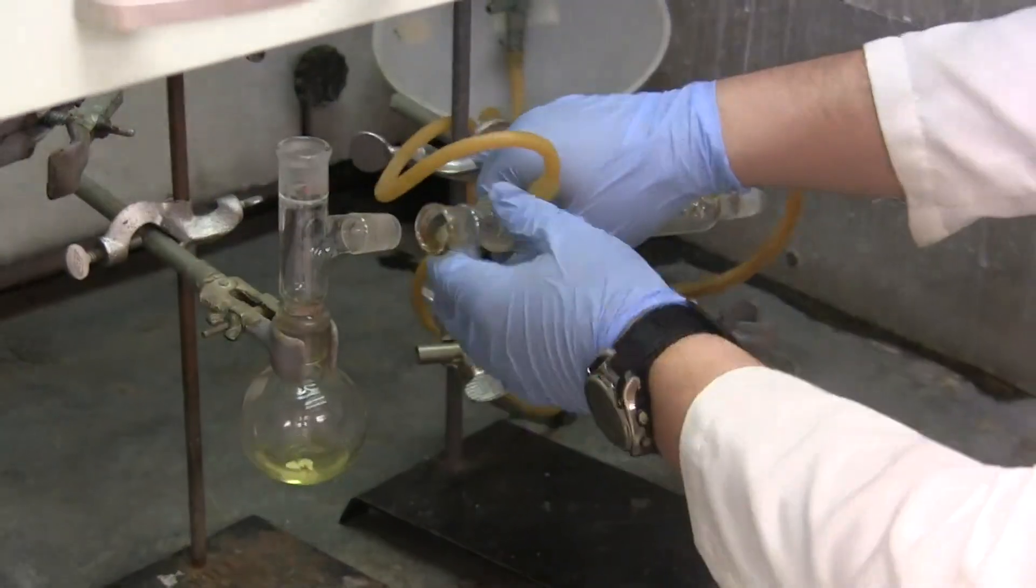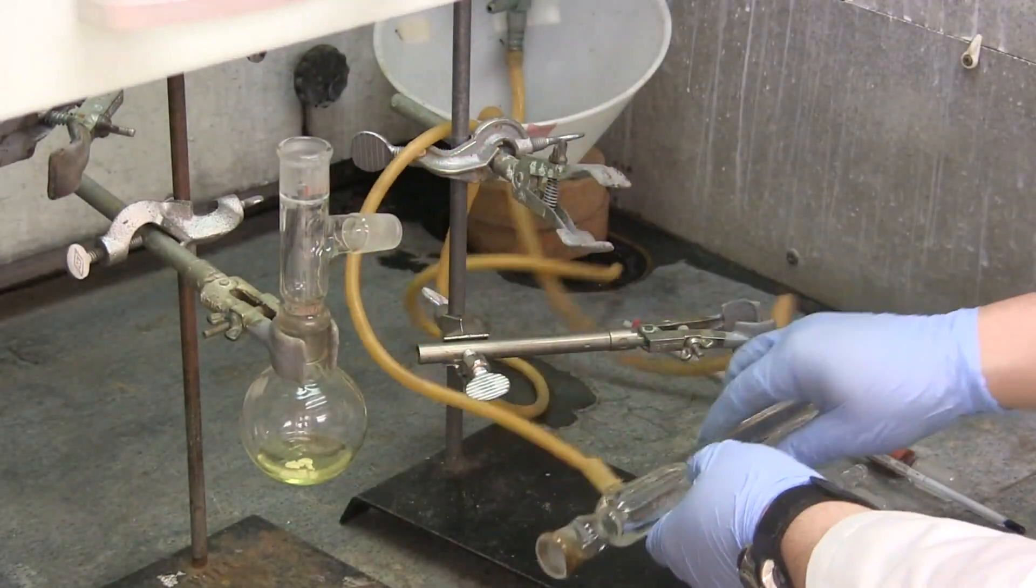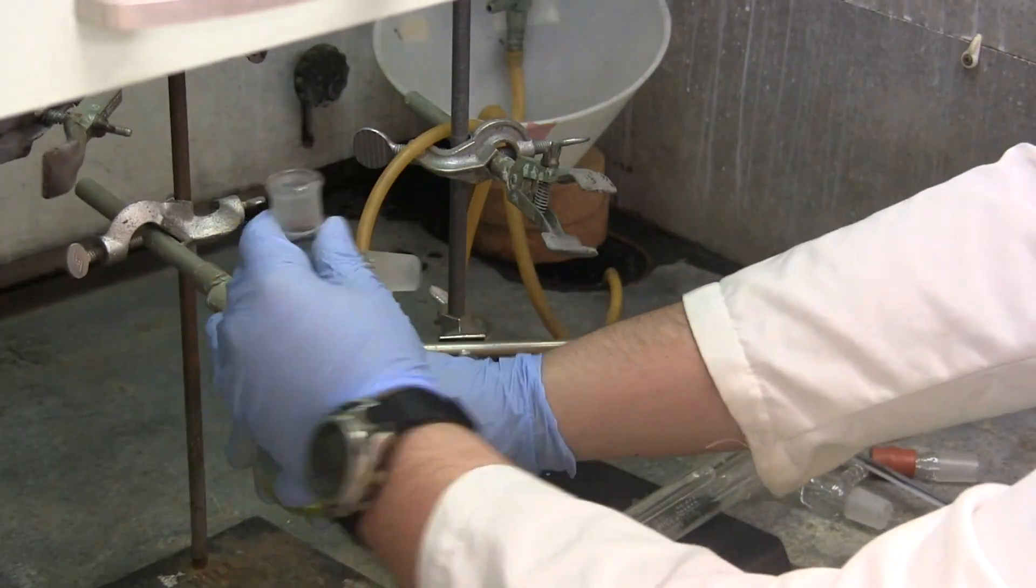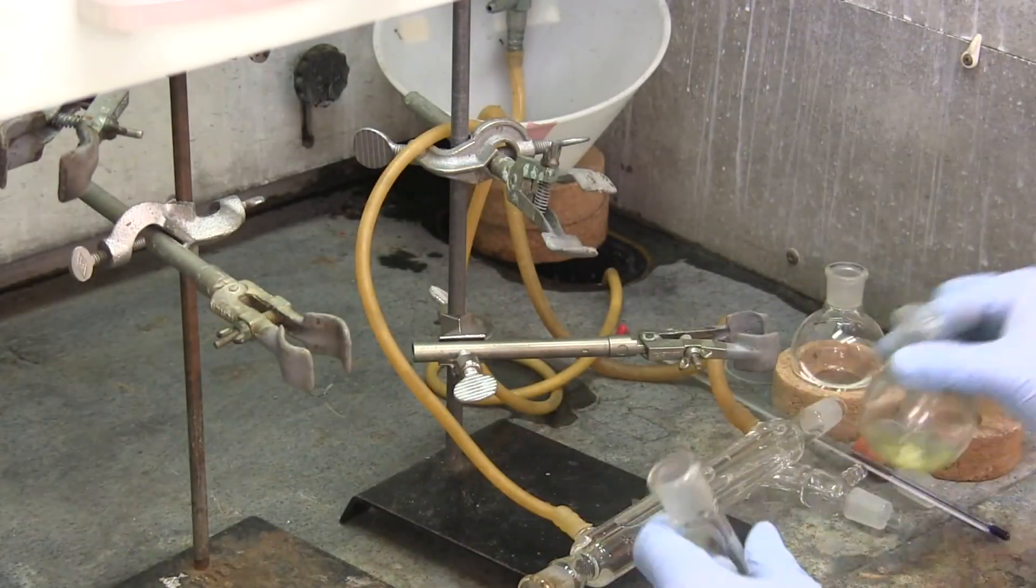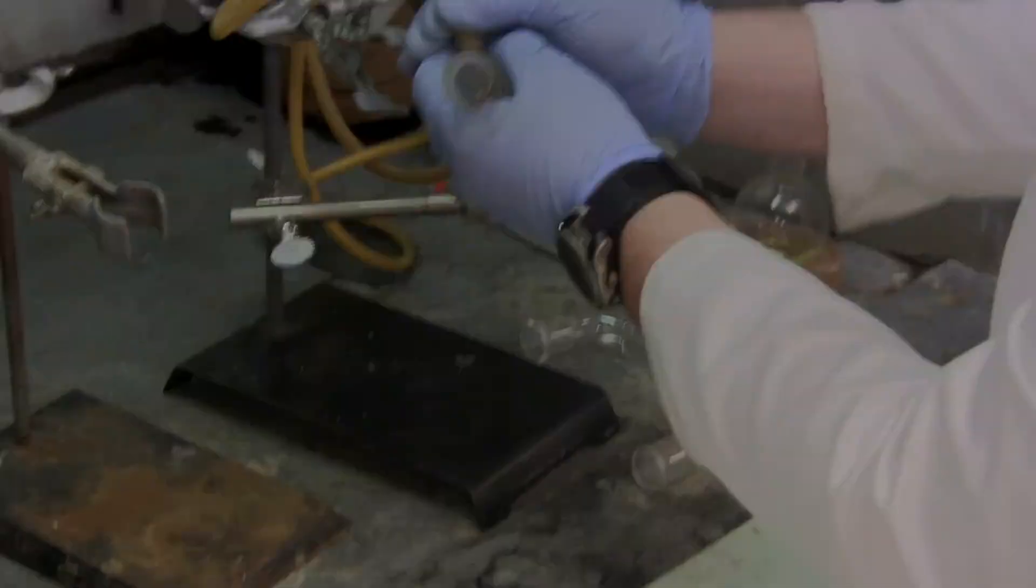At this point, you should turn off the heating mantle and let the flask cool down. Once it's cool to the touch, start disassembling the apparatus and rinse with acetone to clean.